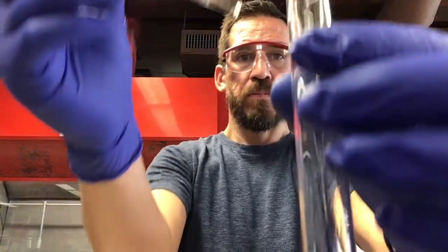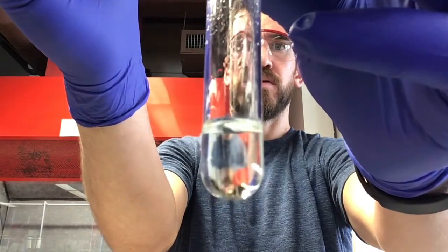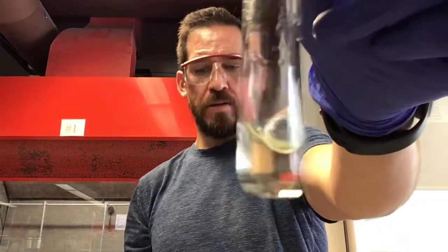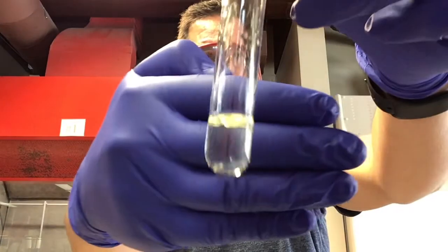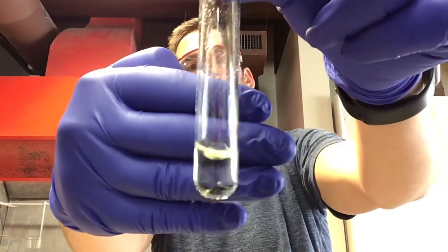Now, the next one is, what do you think it is? 1-bromobutane. Number 4. Okay, 1, 2, 3, 4. Can't tell. This one looks a little bit more yellow, but it is difficult to tell.